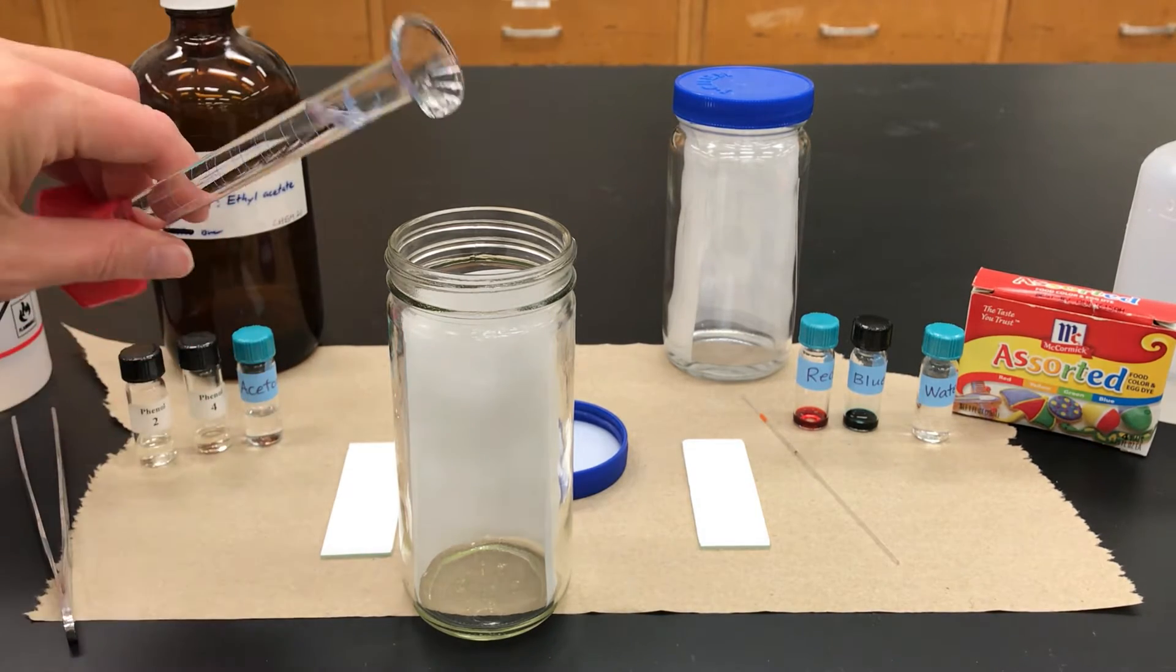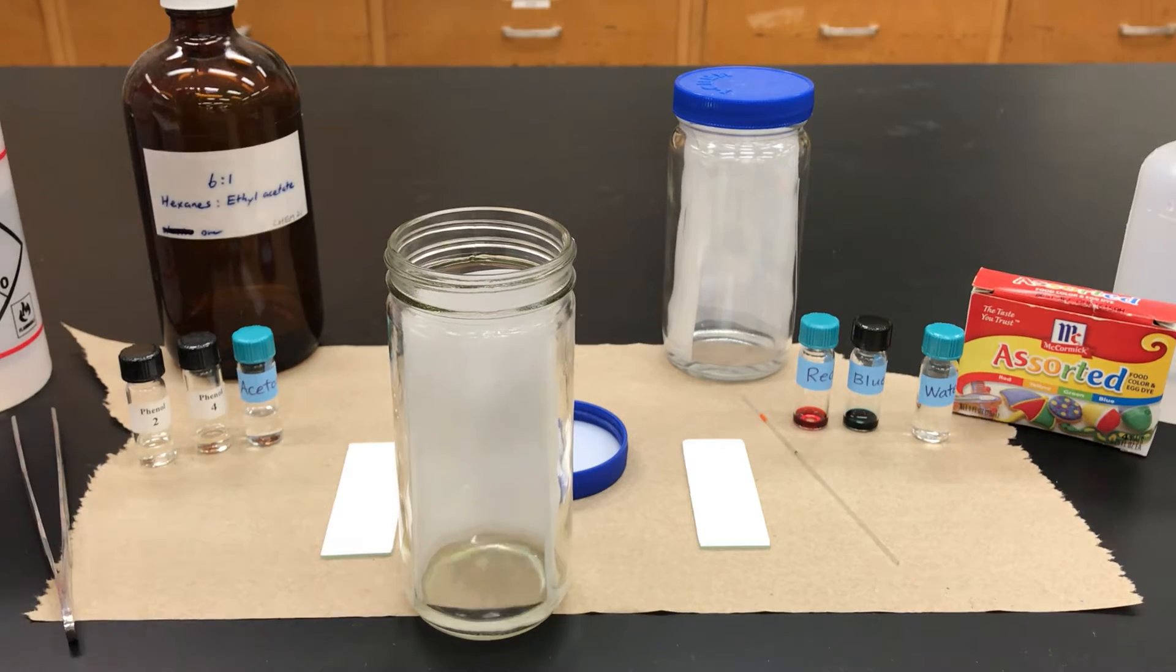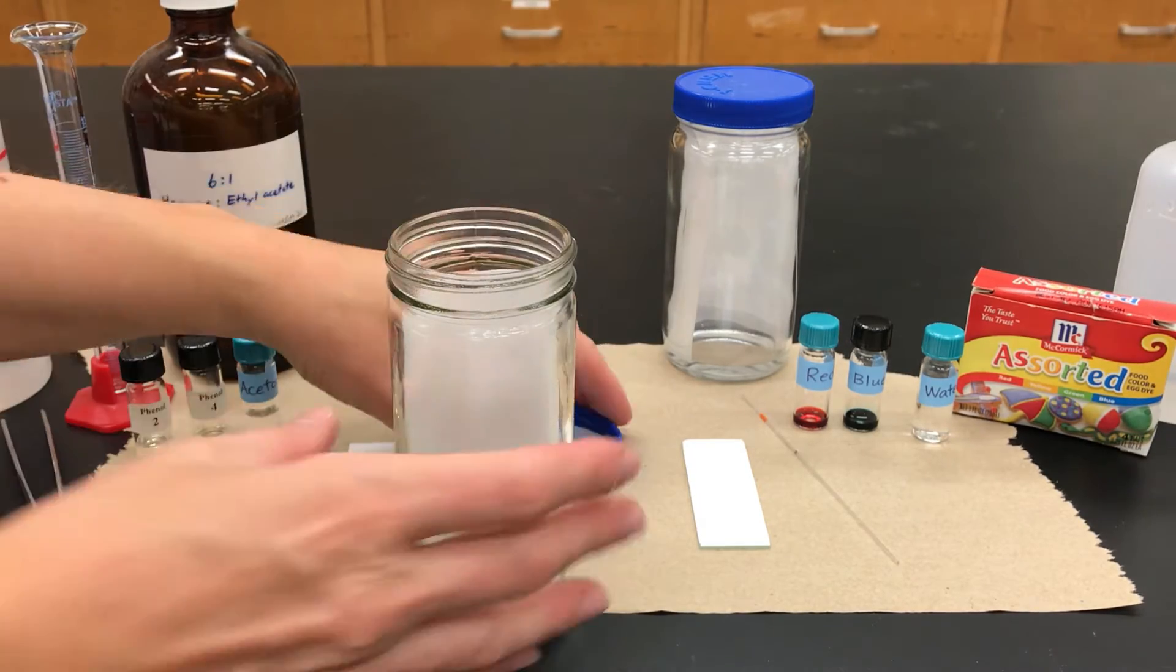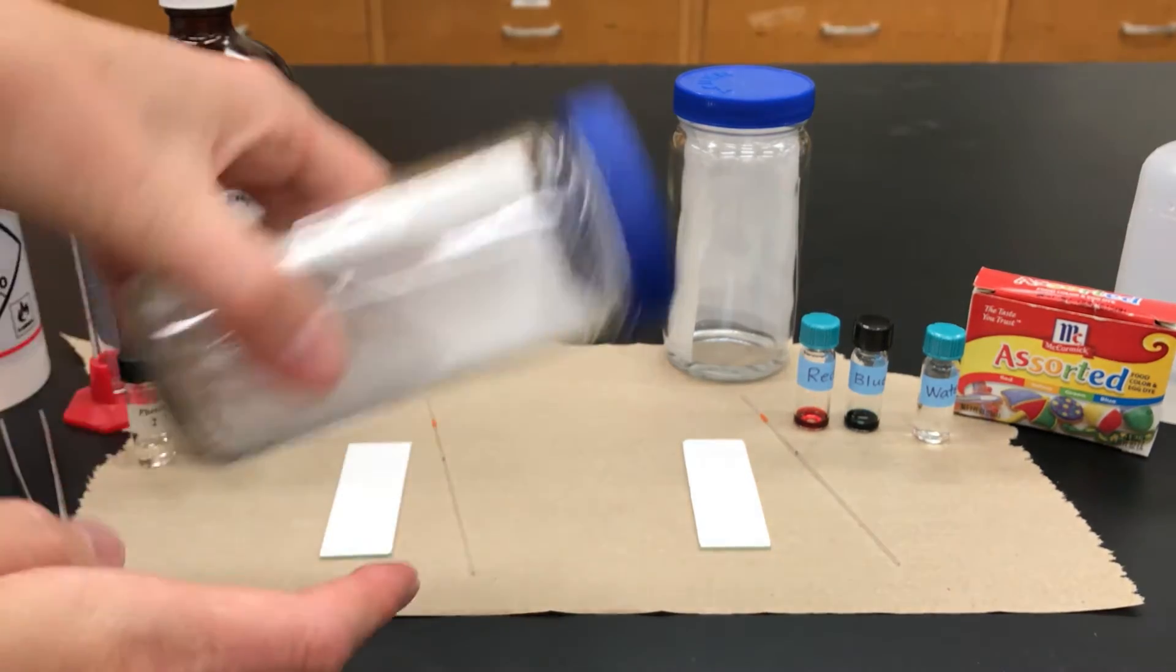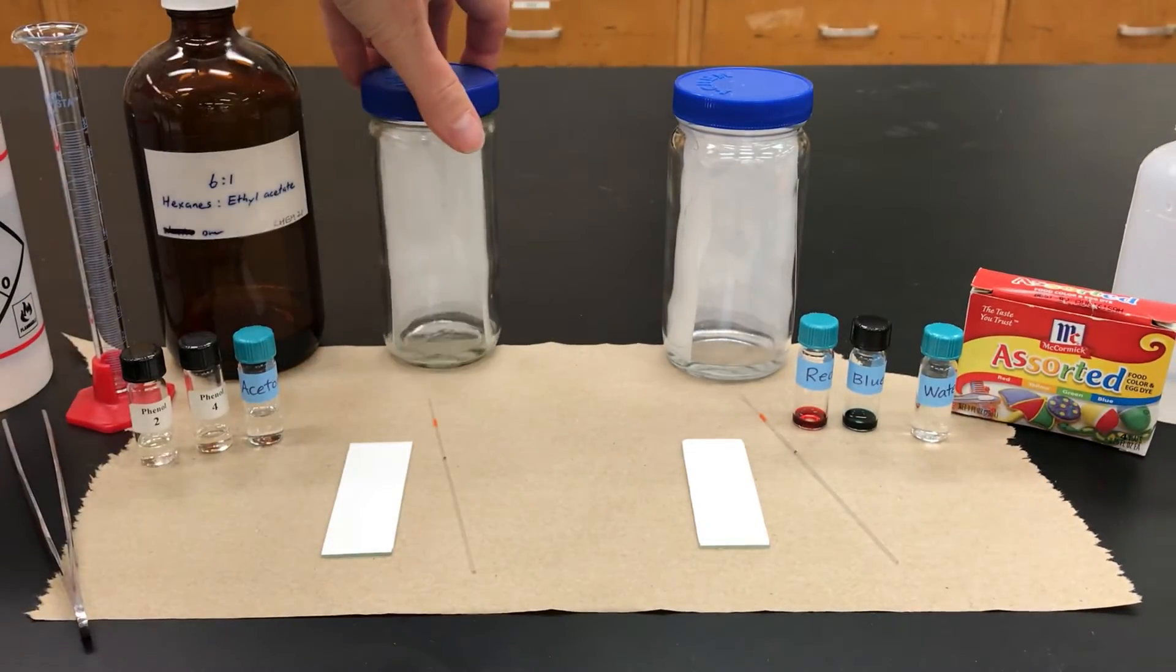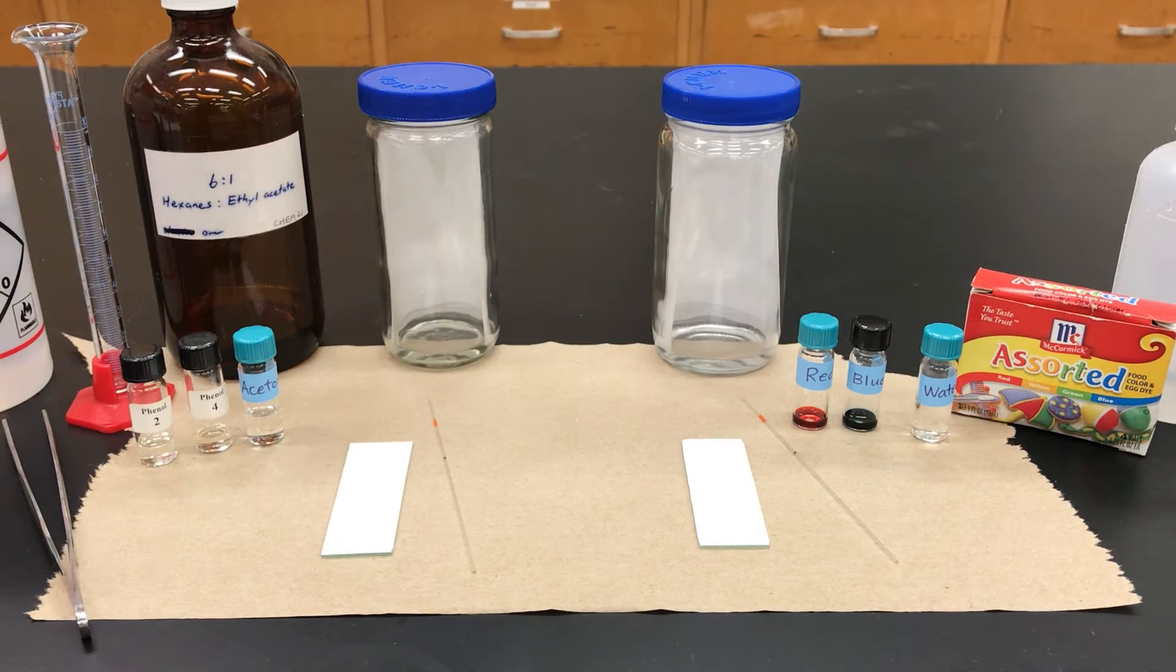In the second one, I'm doing a 6 to 1 volume ratio of hexanes and ethyl acetate. TLCs run with different solvents. It's something that you have to write down because that's a variable that you can change. So my chambers are ready. I'm going to leave those off to the side.